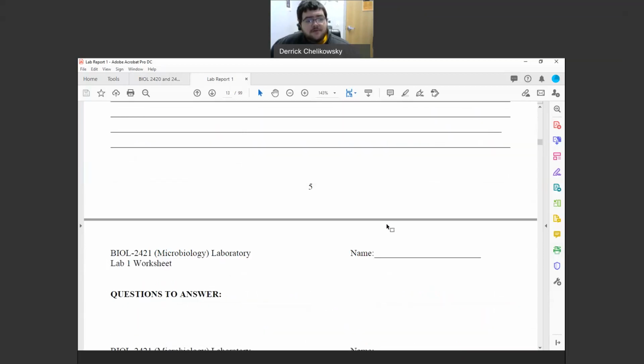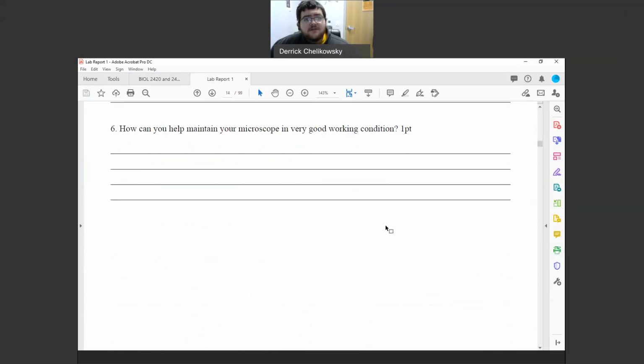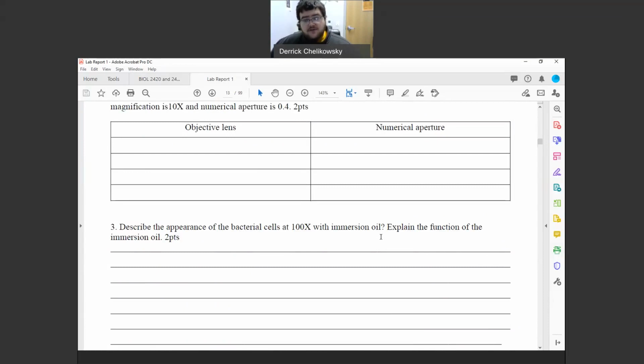Now, in the future, we'll tell you what you need. In the case of the majors, for the majority of your semester, it's going to be your unknown, and we will give you PDFs with your unknown. The PDFs can be quite large. The specialized staining PDF, you're looking at close to 100 slides. So you're looking at around 115 or so pages. It's up to you to find the right one.